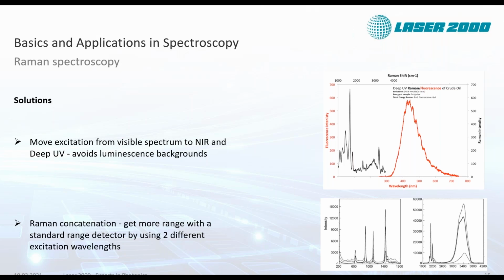So when you use, let's say, a laser for your Raman experiment with 785 nanometers excitation wavelength and have a spectrometer set accordingly to that range, you can get very close to the excitation wavelength and get a spectrum of the so-called fingerprint region.